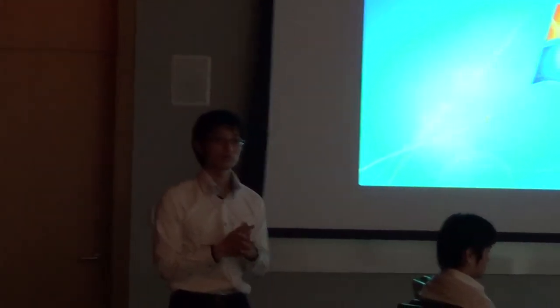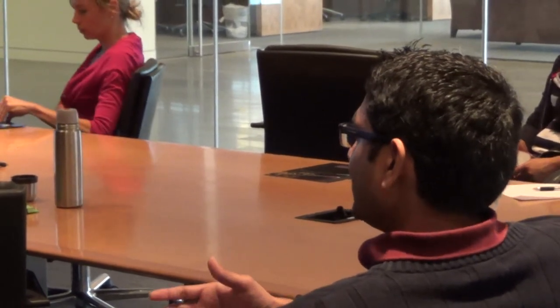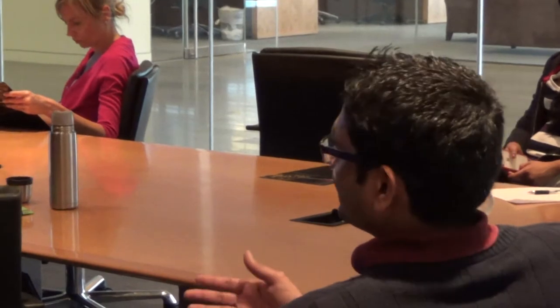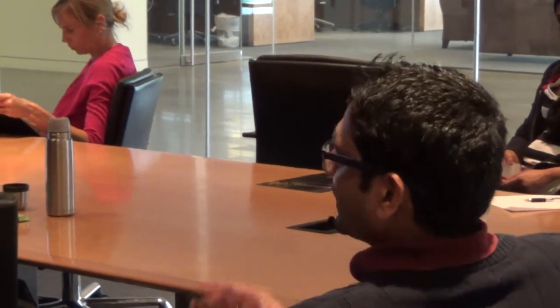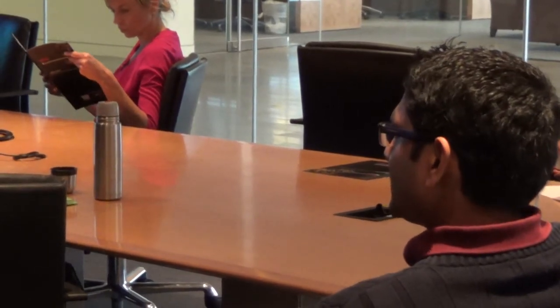So for example, if we want to sort the library, it's like 10 to the power of 7 that you would expect to have. And if you start with like, for example, 300 microliters, which has 5 times or 10 times the library size, do you think you will have enough sample size or volume to have 10 to the power of 7 cells? Or will it be diluted a lot? Most of the time, sometimes you would like to isolate your DNA from the sorted sample. And if it is diluted a lot, there are very difficult ways to get the DNA out of it. So what you would do is try to avoid dilution of the sorted population.